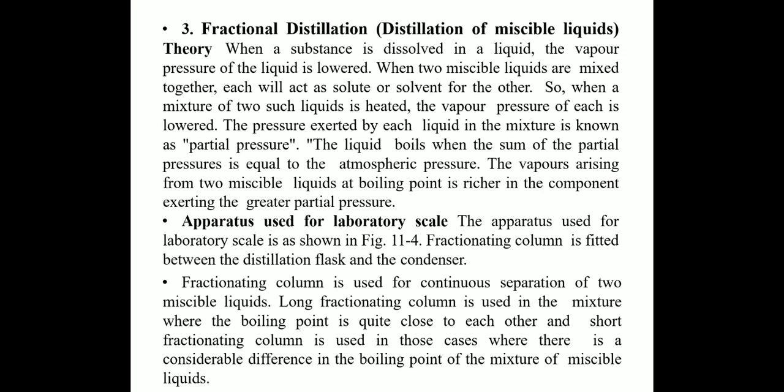Next type of distillation we have is fractional distillation. Distillation of miscible liquids. When a substance is dissolved in a liquid, the vapor pressure of the liquid is lowered. When two miscible liquids are mixed together, each will act as solute or solvent for the other. So, when a mixture of two such liquids is heated, the vapor pressure of each is lowered.